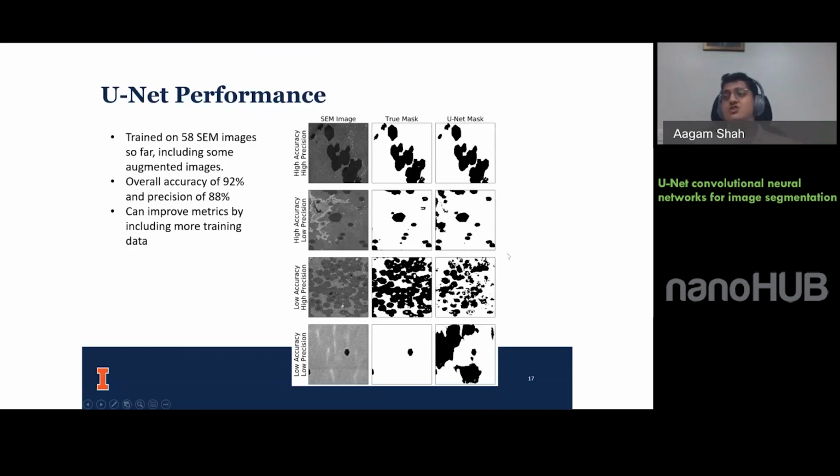But in general, a UNet is an architecture that allows us to generate a good model with relatively few images, and also use data augmentation. We can use augmented images that we generated to train our model, which is quite handy and unique when we have a very small number of images at hand.